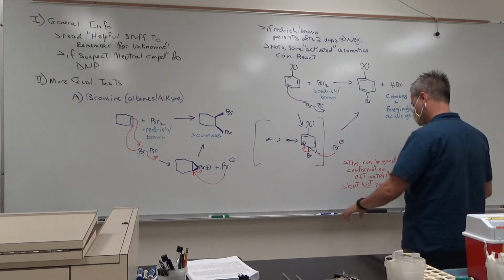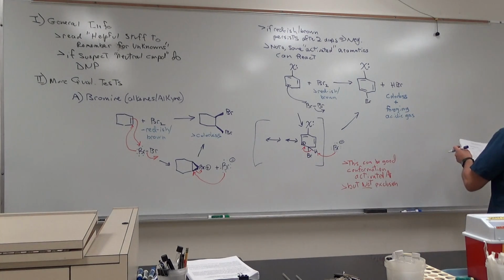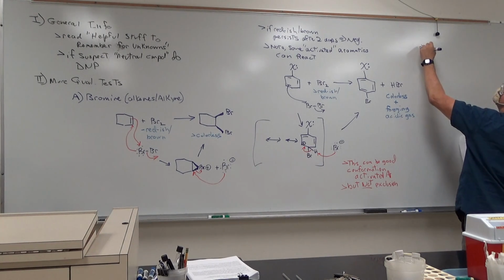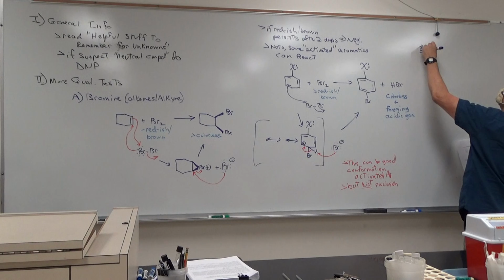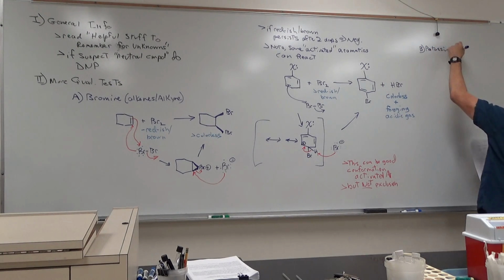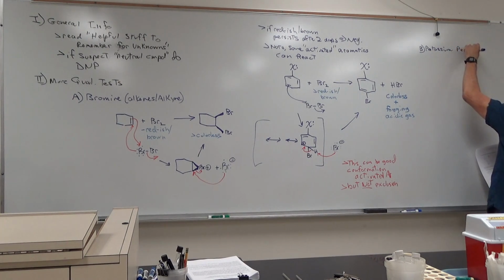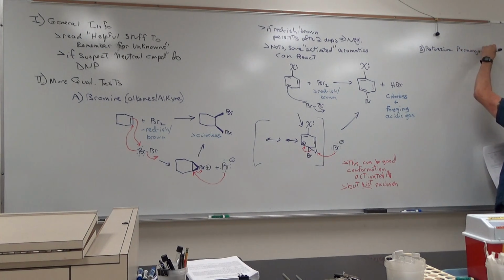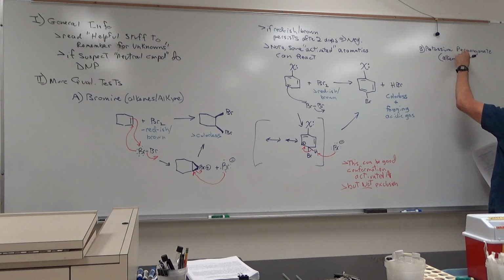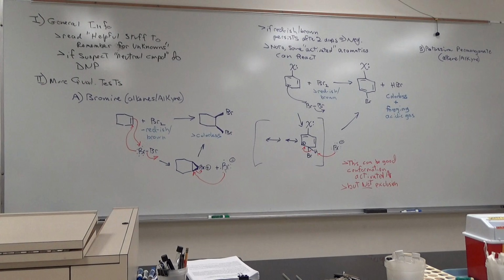All right. Squeeze in potassium permanganate. And potassium permanganate is just sort of confirmation of alkene or alkyne.